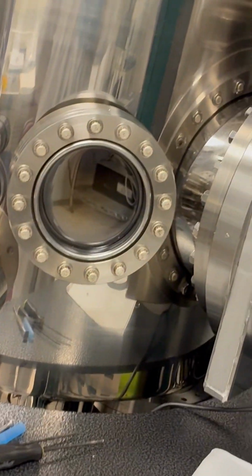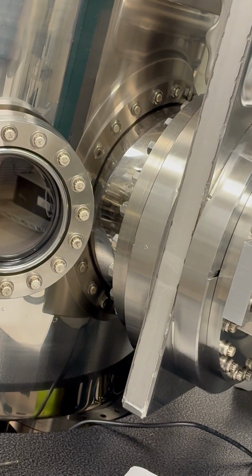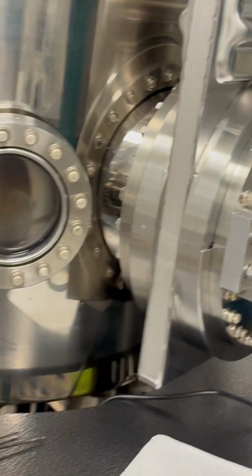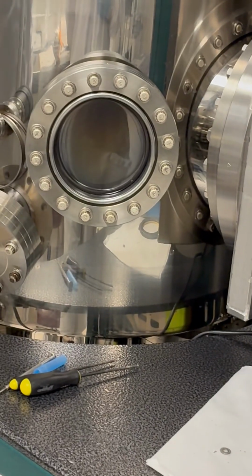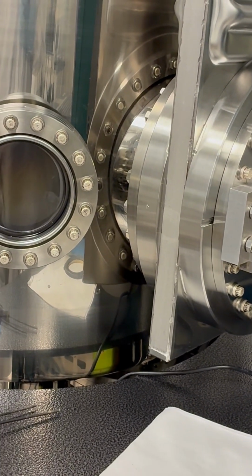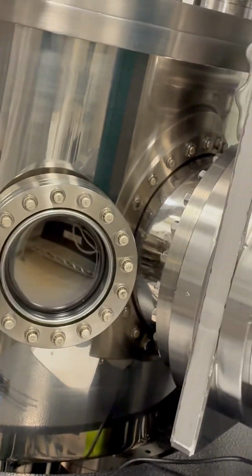Because I'm going to have to bring that sample down, and if the QCO is in the way, if I press this down button, it's going to happily just break that arm right off. You understand? It's just another example of how, if you don't know what you're doing, you can easily damage this very expensive machine. Okay? All right, so I moved that out of the way.